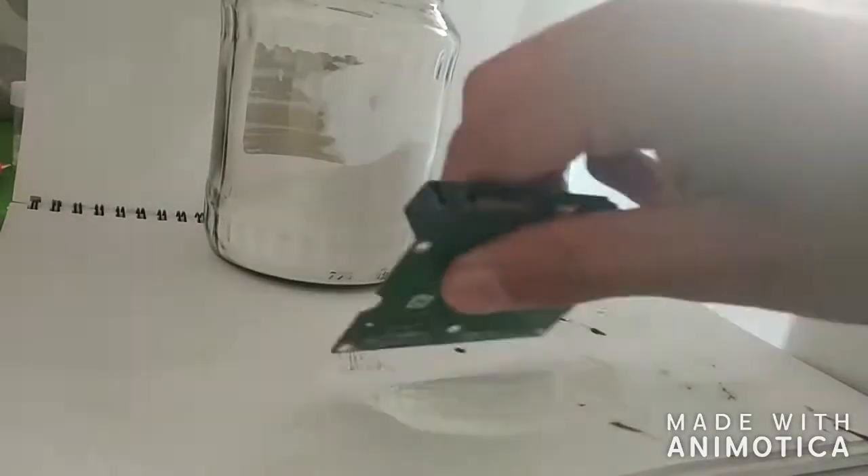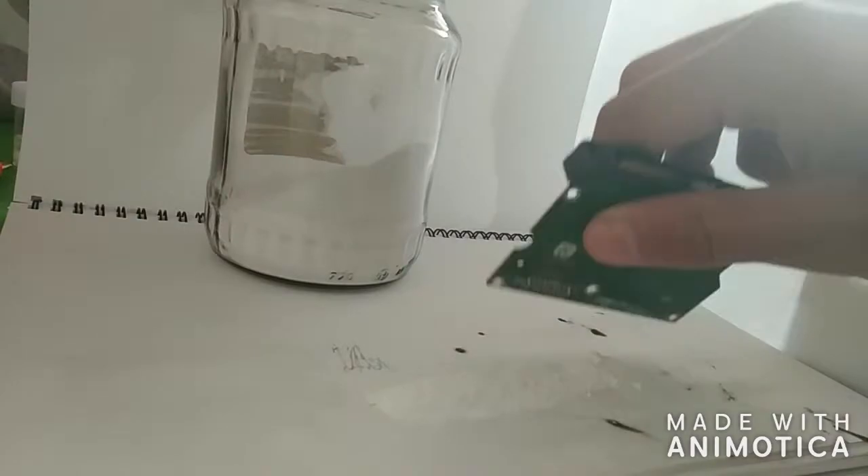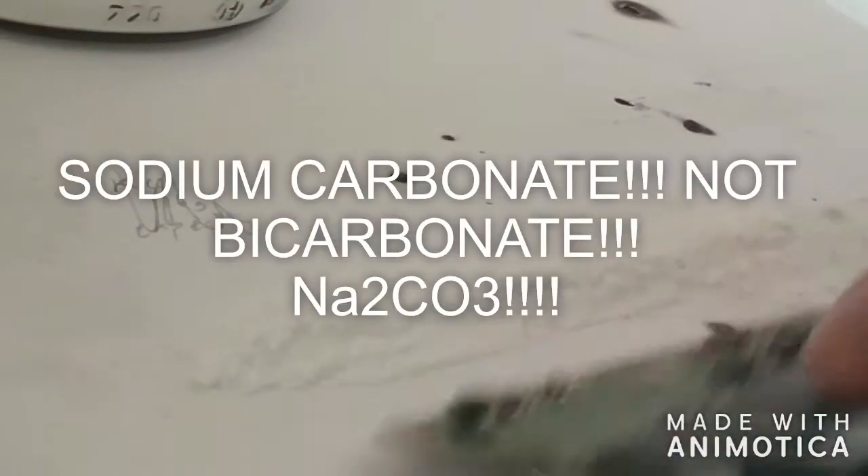Just leave it on there for a few minutes, and that's how you know you've got sodium carbonate.